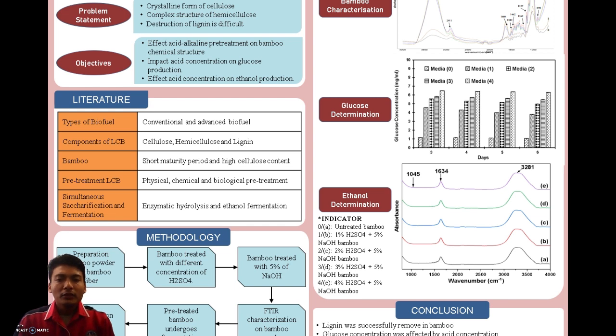The data obtained shows that there is no formation of a peak which represents the existence of ethanol in the sample. Supposedly, there will be a formation of an absorption wave between 1060 and 1001 that indicates the appearance of ethanol in the sample. The presence of IR peaks in that region is due to the absorption band of C-O vibration. Hence, it can be concluded that there is no bioethanol in the untreated and treated bamboo samples.